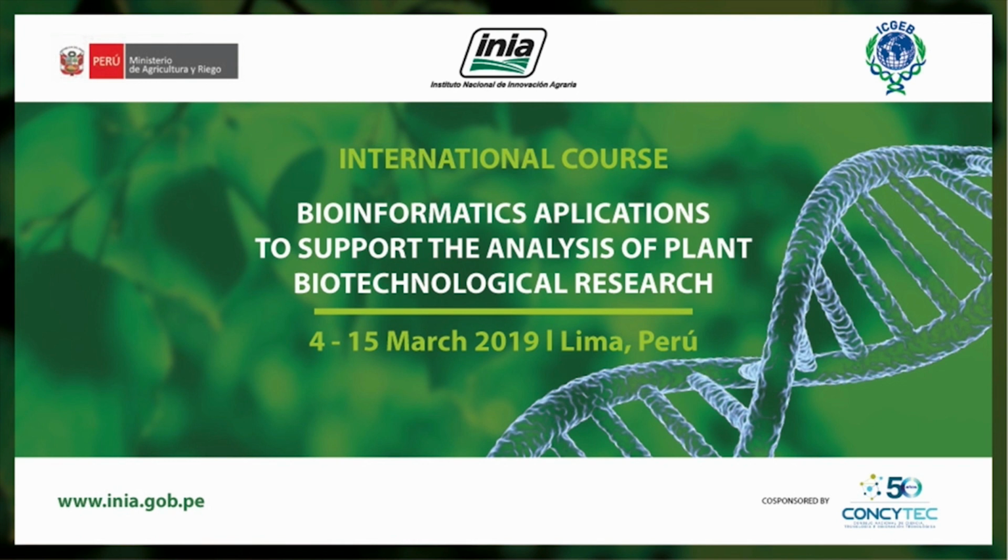How's it going? There you go. Yep. Looks good. Easy. This is a FASTA, isn't it? Okay. Have you aligned them?